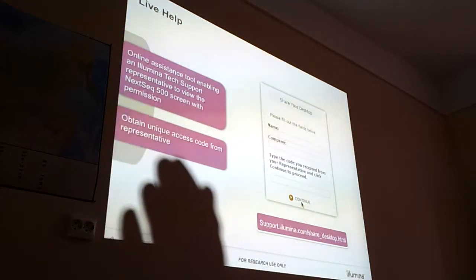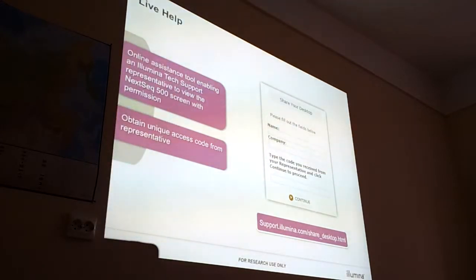If you use it the first time, you have to download something. And then the guy or the girl in England can see your desktop, and they can help you. And afterwards, you finish the session, and then they have no access. So don't worry, they cannot spy on you.